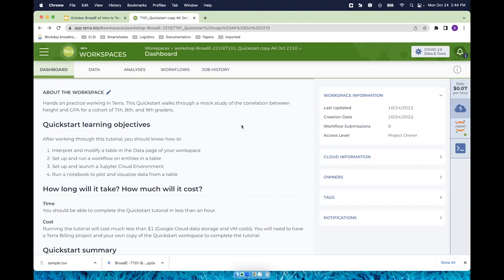Yeah. So I'd recommend starting with defaults. And actually I'll be going into billing more in my presentation, but start with the default environment settings. And then we have a lot of documentation and tutorials where we share, if you want to run this pipeline, here is how we've configured the workflow and the parameters for the machine.